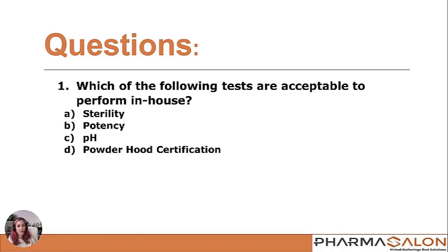All right, question 1. Which of the following tests are acceptable to perform in-house? Sterility, potency, pH, or powder hood certification? So which one of those tests listed do you think is appropriate to perform in-house? Now, keep in mind, I'm not asking which one is possible to perform in-house, but which one is appropriate to perform in-house.